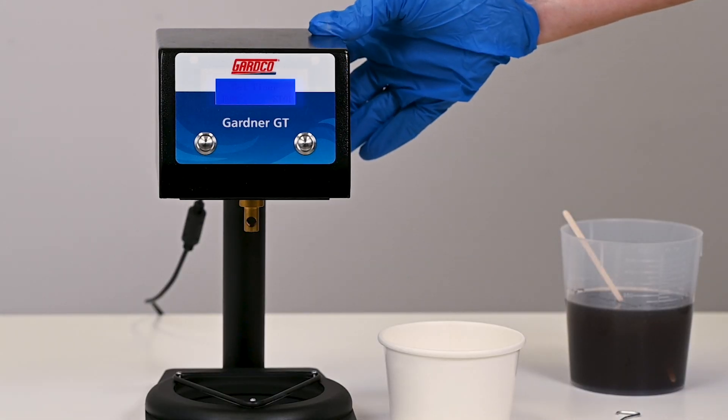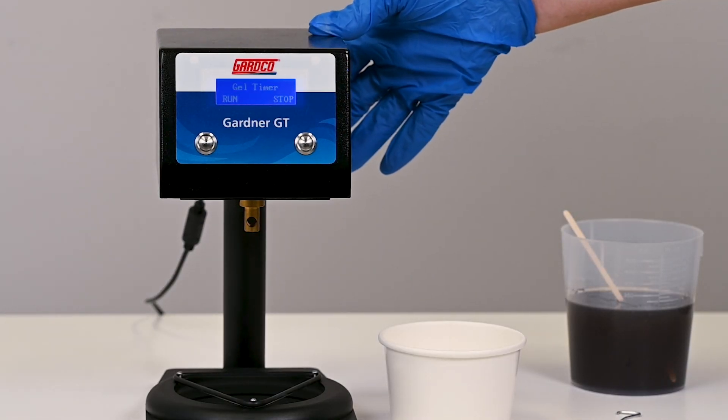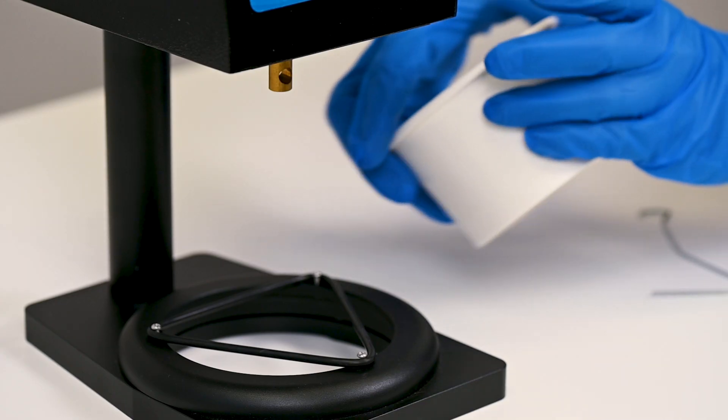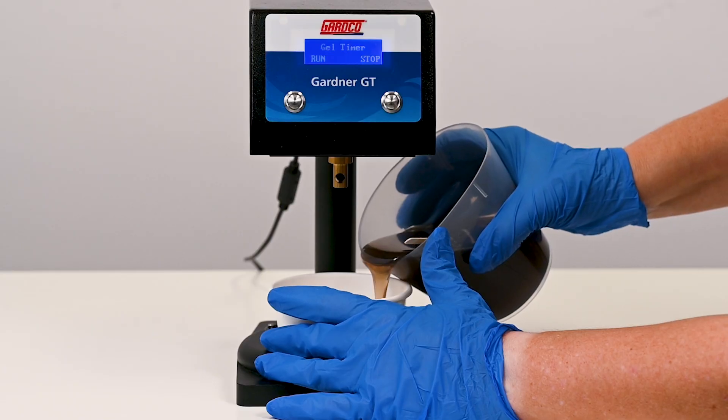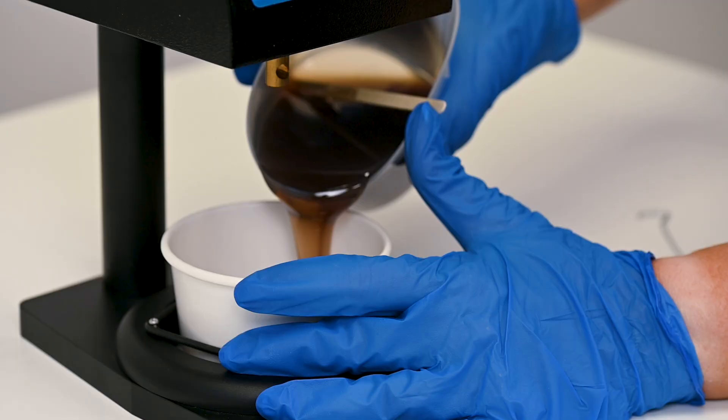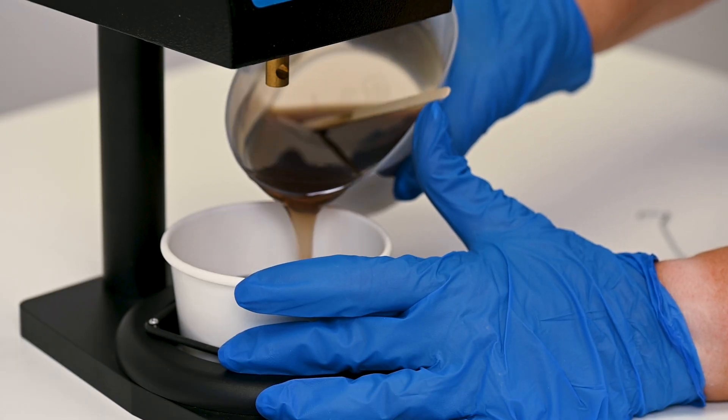Turn the gel timer on by flipping the switch on the back of the unit. Place the supplied paper cup down into the base unit between the elastic O-ring. Pour a minimum of three fluid ounces of your sample into the paper cup.